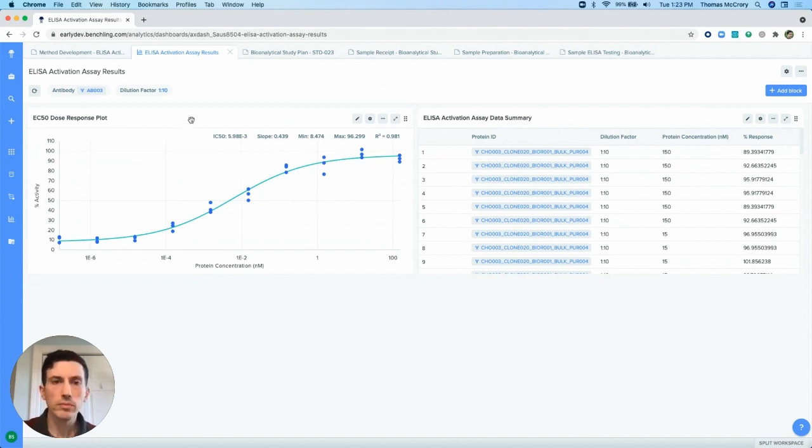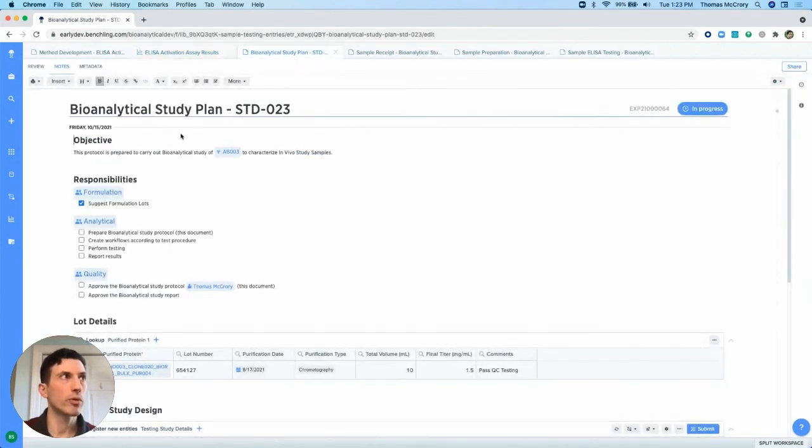All right, so moving beyond this, as I alluded, really the next step of our process here is to establish a study plan. And we'll do that in Benchling through use of a templated study plan. So where this is mostly completed here, where we've identified our objective and we've utilized at mention functionality within Benchling to collaborate on creation of this study plan.